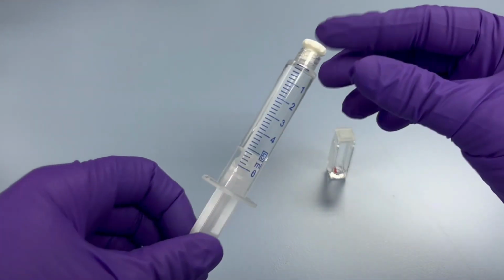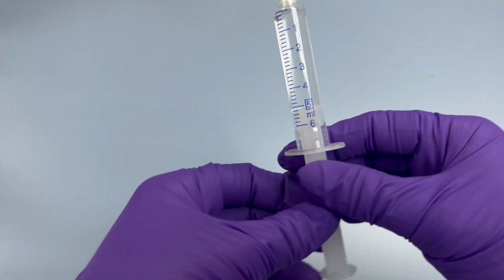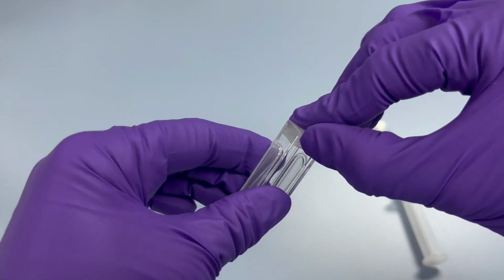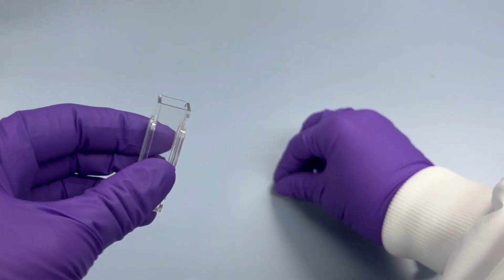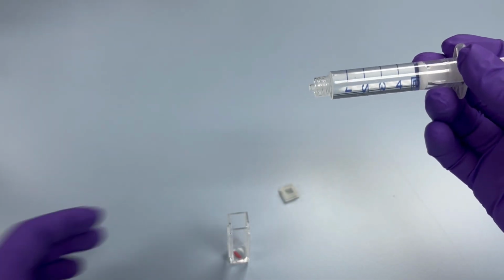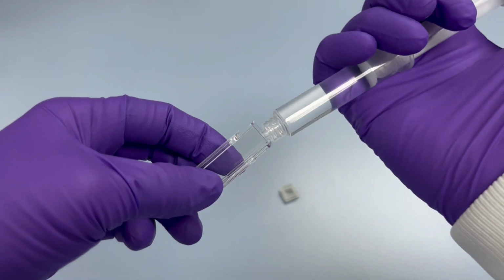This is our extracellular matrix, which is transparent to allow for proper light transmission. And we simply fill our matrix into the cartridge, doing that slowly so we don't have any bubble formation over time.